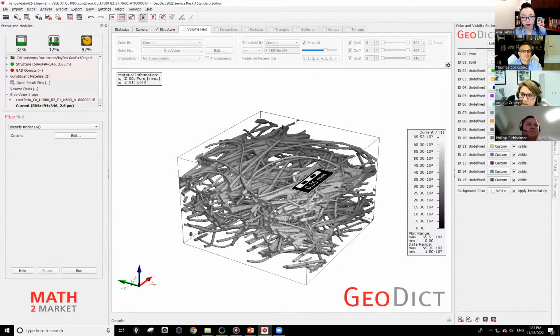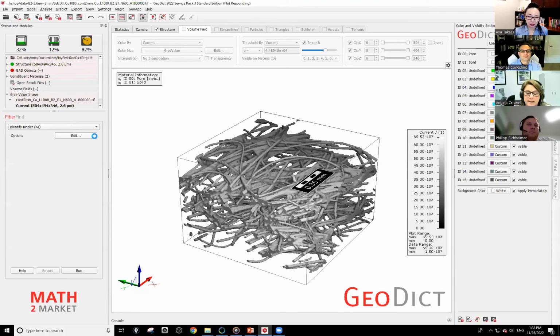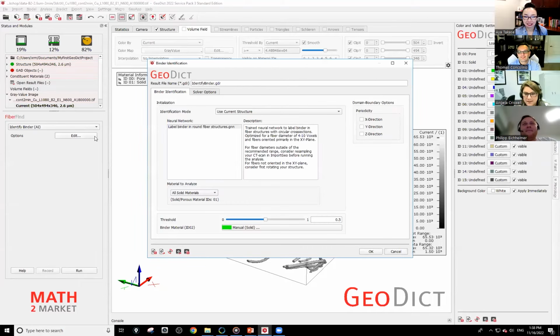This is where we played Jeopardy music, I guess. Looked like it popped up. Did it come up behind the window? Nope, it's not. It's there, it's thinking. That should be on our list to learn to sing. Yes, it should be. Or we've budgeted for a new computer with a faster GPU. That'll help too. Exactly. But we use our computers for a few years, so this one has a slower processor and GPU.